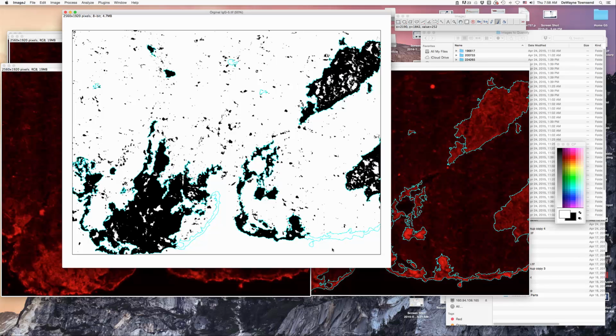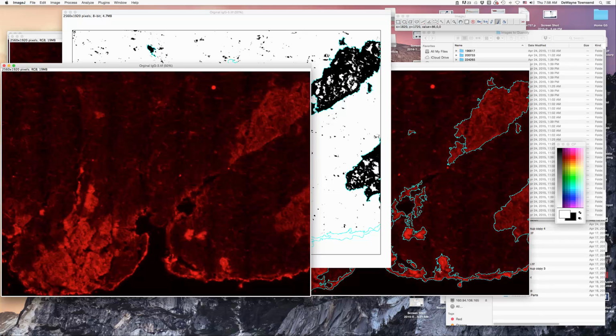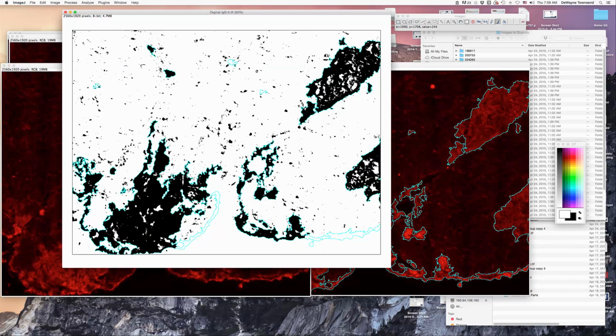Okay, so that's that. Now this area gets a little tricky because you can see there's clearly a positive myocyte here, but this is probably all just noise. So we have to be a little bit selective in how we do this. It's a little bit tricky with the big brush. I'm going to go back to our smaller brush. Okay, and so you can see we can kind of work our way in here, and that looks about right.